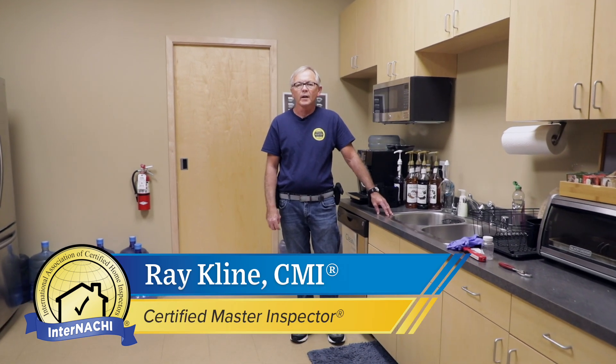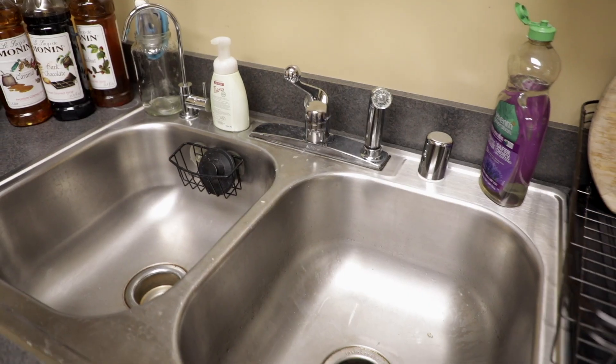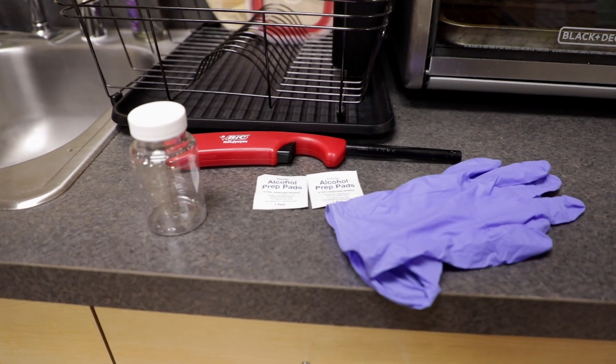Welcome. My name is Ray Kline. I'm a certified master inspector and instructor here at InterNACHI in Boulder, Colorado. Today I'm going to show you how to take a sample of well water for a coliform bacteria test.